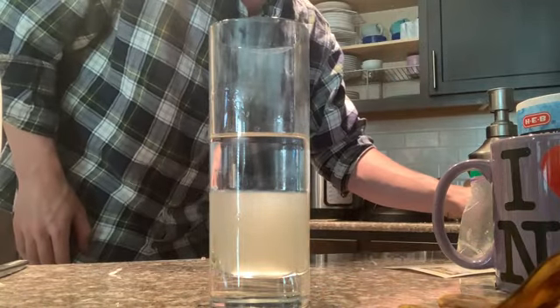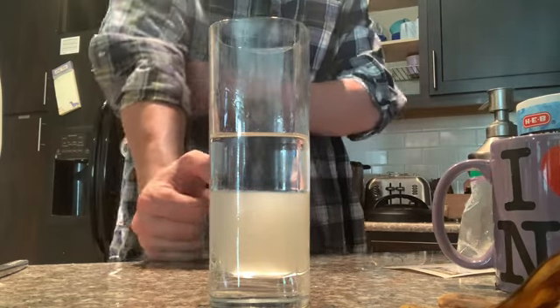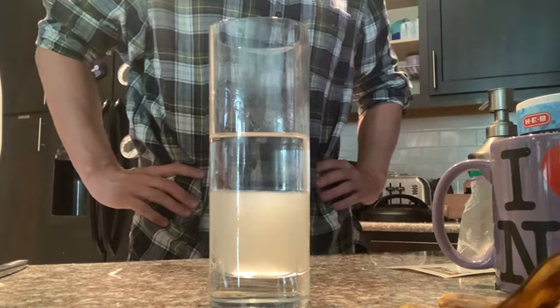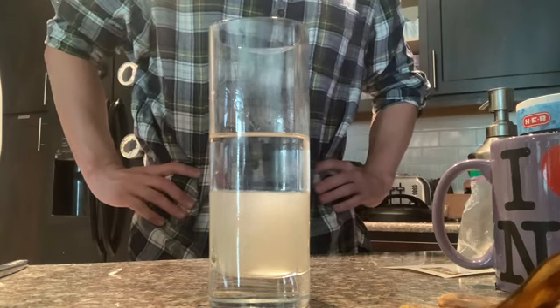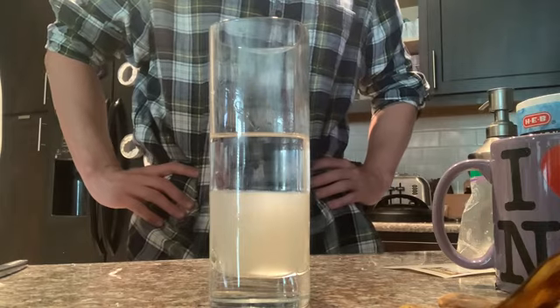All right, after the alcohol layer is set up, wait 8 minutes. Well, okay, guess I have to be patient here. You'll see bubbles and cloudy material moving around the alcohol. This is the DNA pieces clumping together. Nice. So I guess I'll pause the video for about 8 minutes and then we can come back.